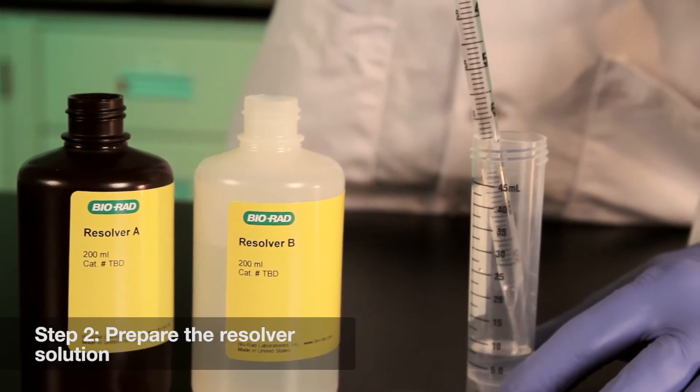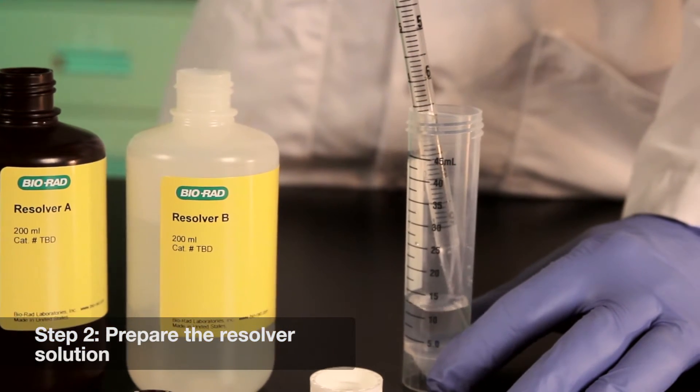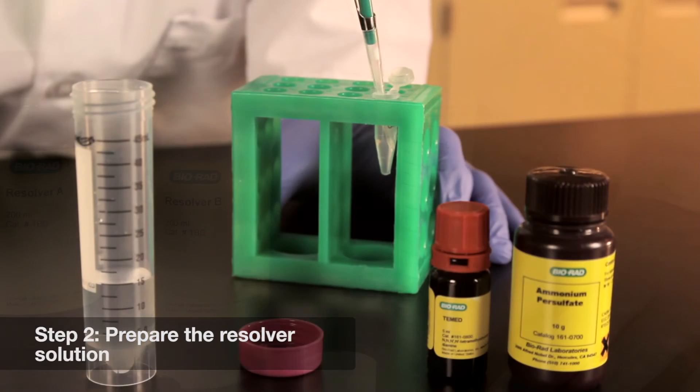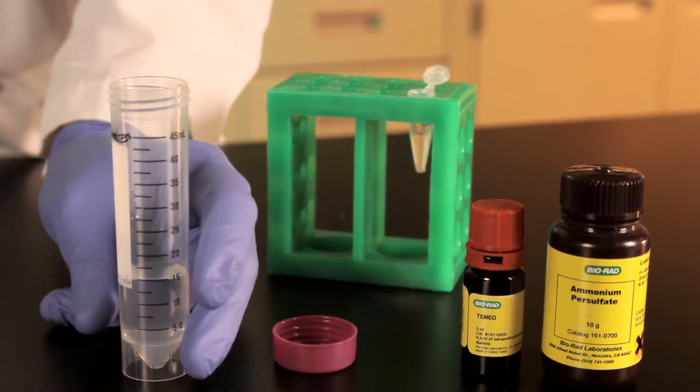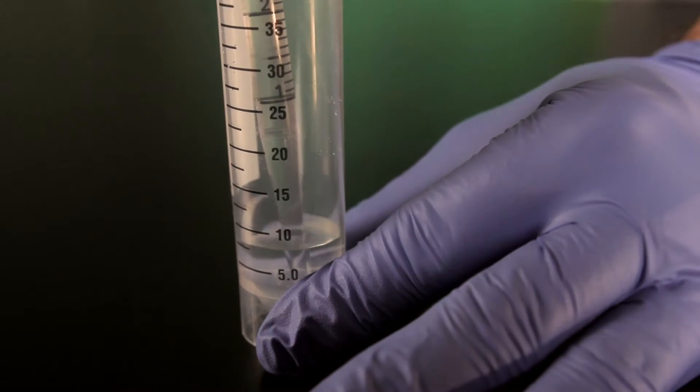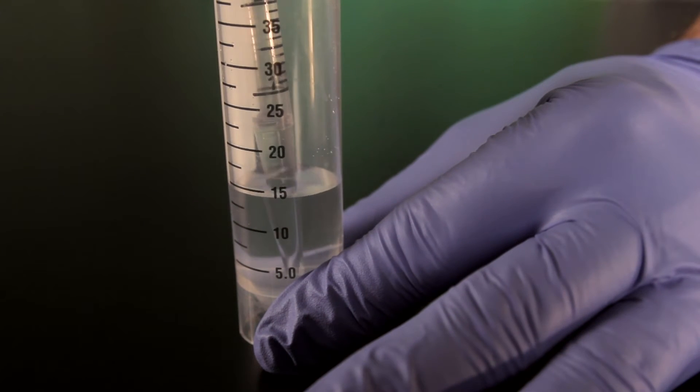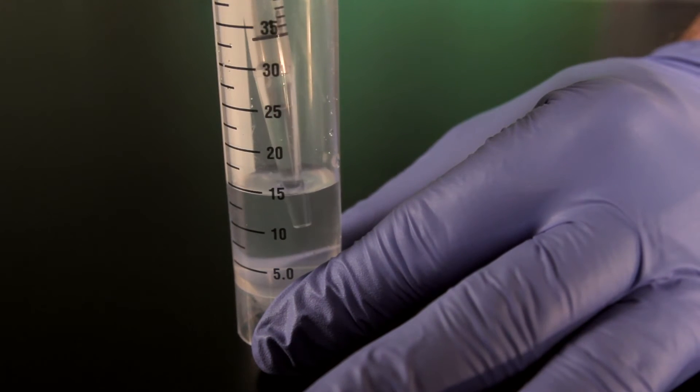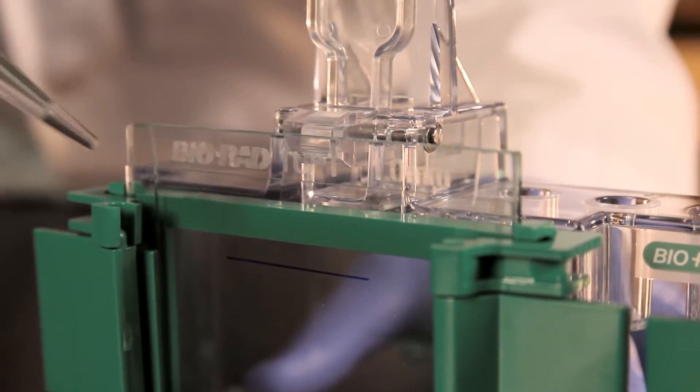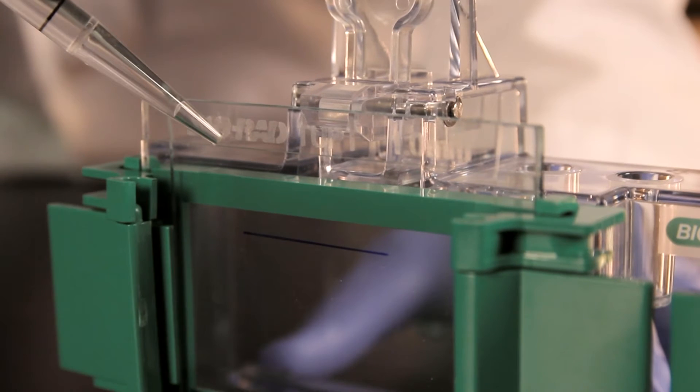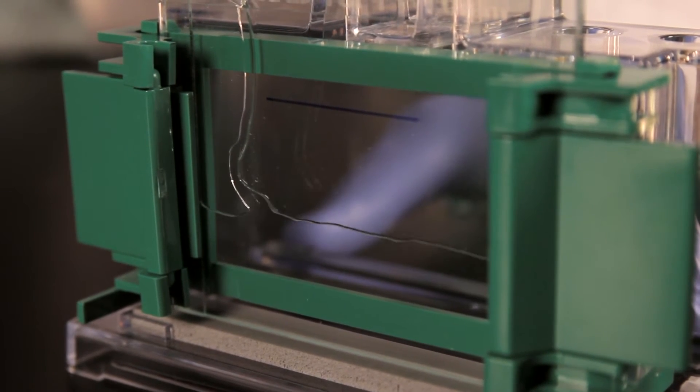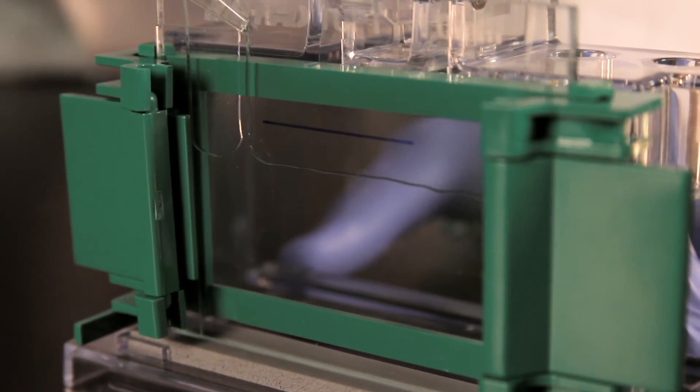Next, prepare the resolving gel acrylamide solution by combining equal volumes of the resolver A and B solutions. Add the appropriate volumes of TEMED and freshly made 10% APS to the combined resolving solution. Mix the solution, taking care to avoid introducing air bubbles. Now remove the comb and pour the resolving solution into the cassette smoothly to prevent it from mixing with air. For fastest results, the stacking gel can be poured without waiting for the resolving gel to polymerize.